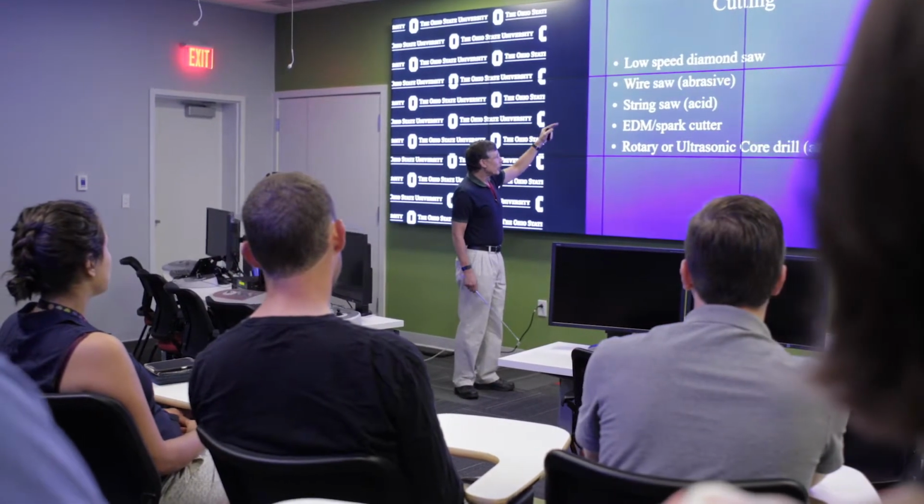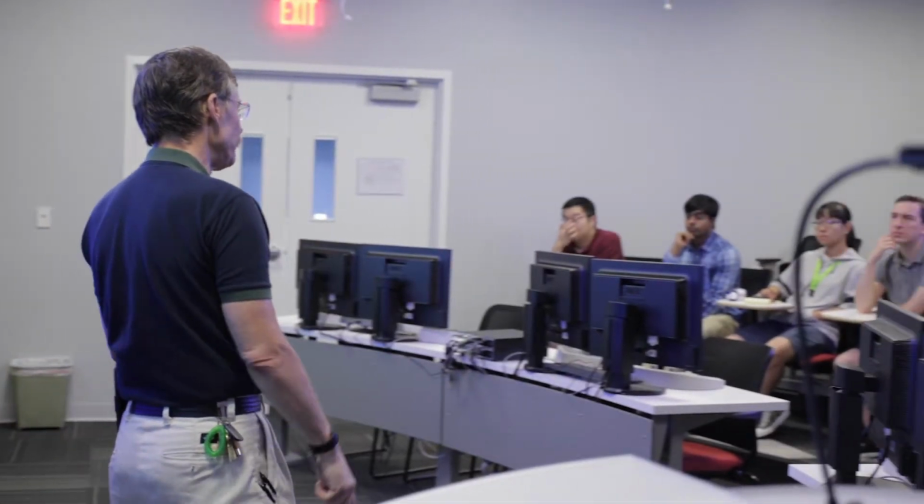The teaching environment that we've developed here in the digital theater, when combined with this remote microscopy capability, is giving us this very unique capability to teach the instrumentation itself to large groups of people. It's actually teaching you how to use it live.